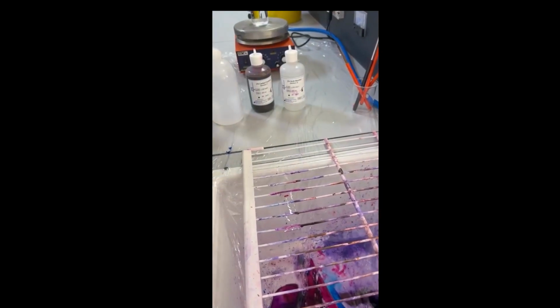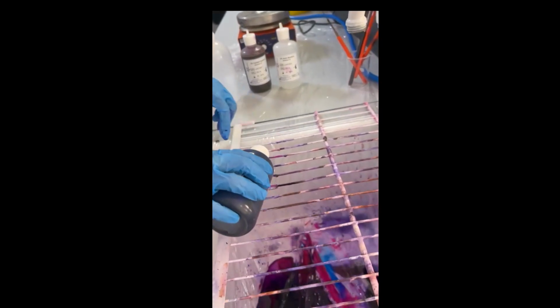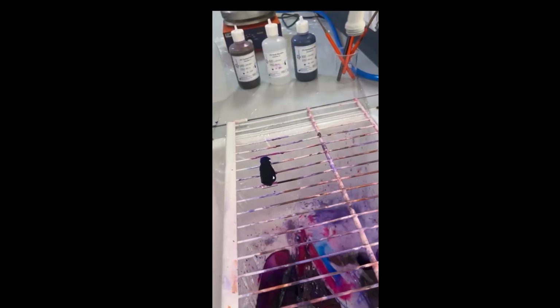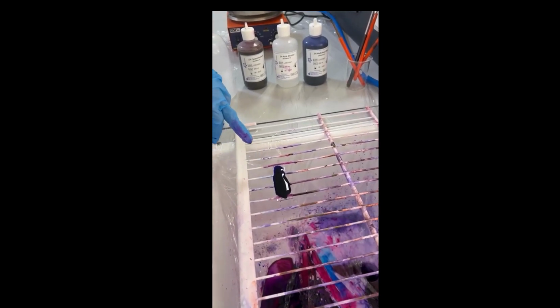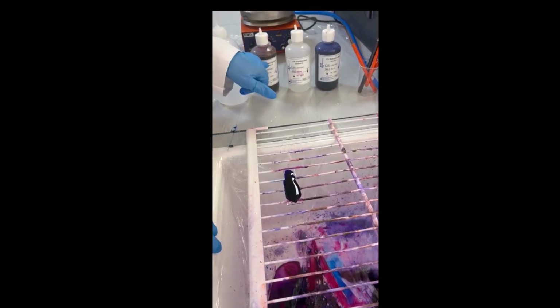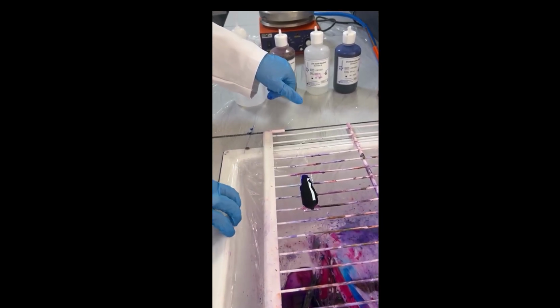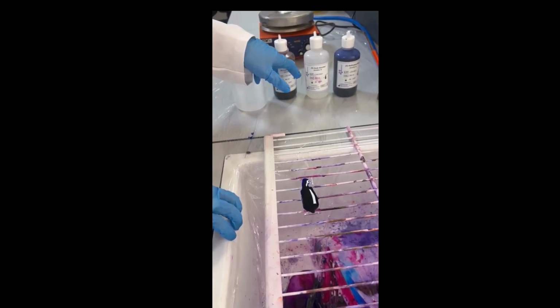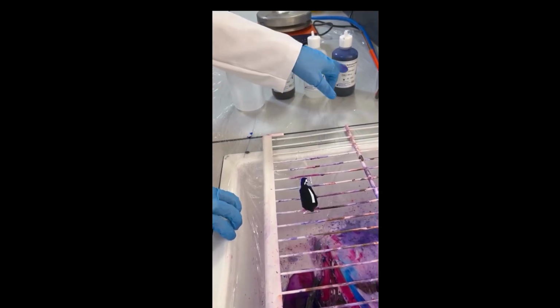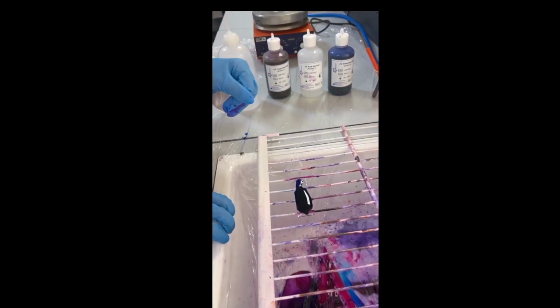The counter stain is methylene blue. Add it to the slide for about 1 minute. The non-acid-fast bacteria will take the counter stain, which is blue, while the acid-fast bacteria, with the help of the heat, will take the primary stain, which is carbol fuchsin, and retain it. It will not be removed during the decolorization. It retains the primary stain and appears red under the microscope, while the non-acid-fast bacteria will take the counter stain after the step of the decolorization.